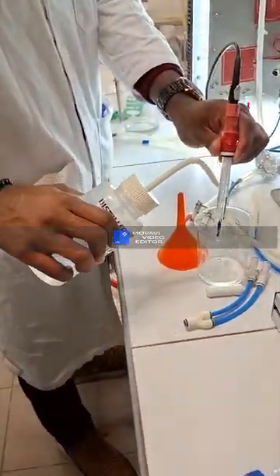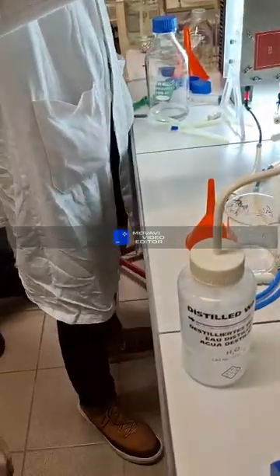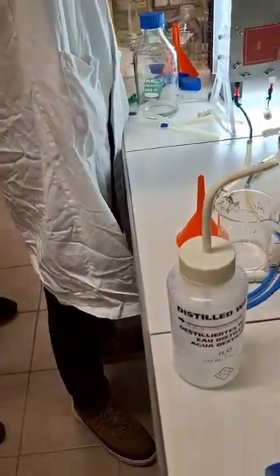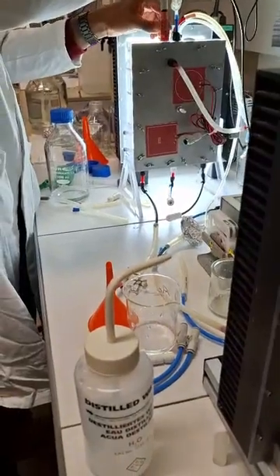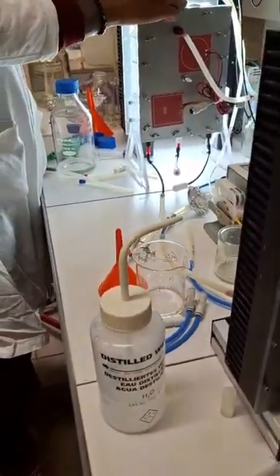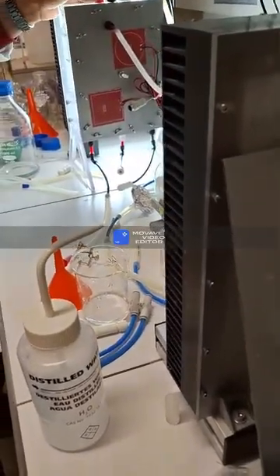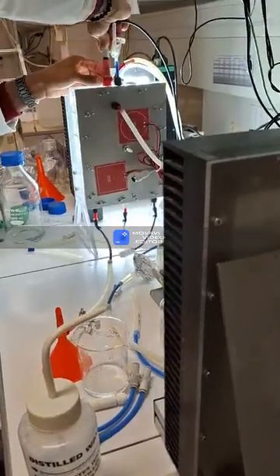Rinse again, and after just put it here inside the culture, and after we're not able to remove it again. We don't remove it anymore, yes?